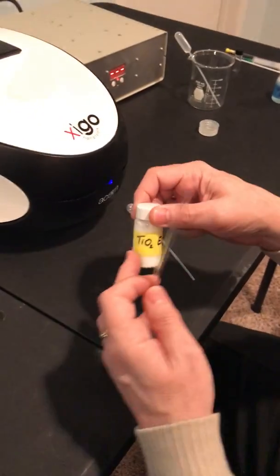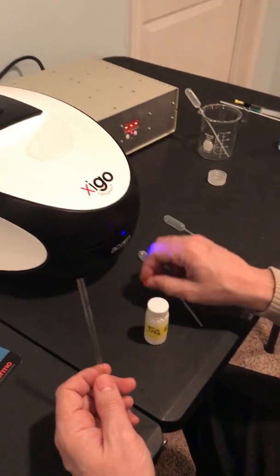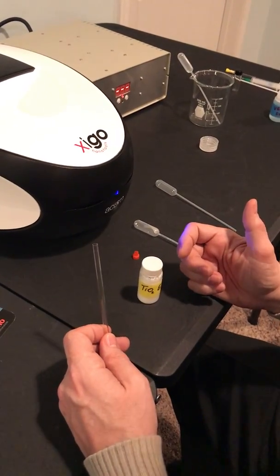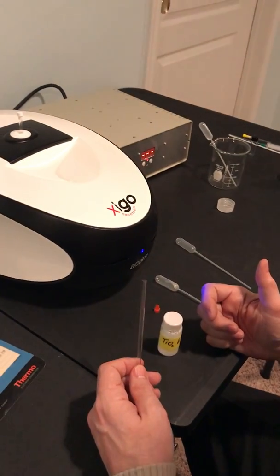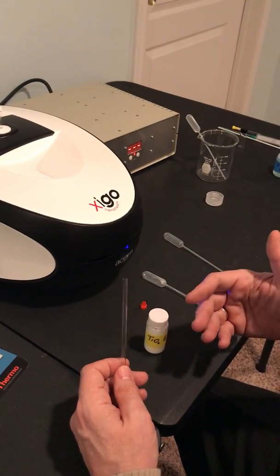So now I'm going to fill my NMR tube here with this sample of TiO2. I have my cap ready, my tube ready, my pipette. I've already set up the software, so I'm basically ready to go. In general, you want to prepare the software first, then load the sample, and make the sample measurement immediately. This way, any issues which may be associated with sedimentation are minimized.